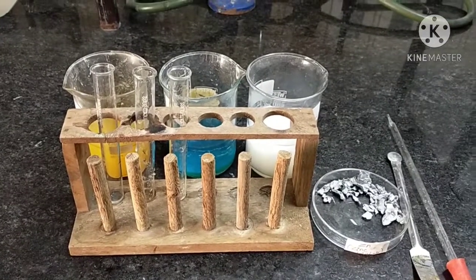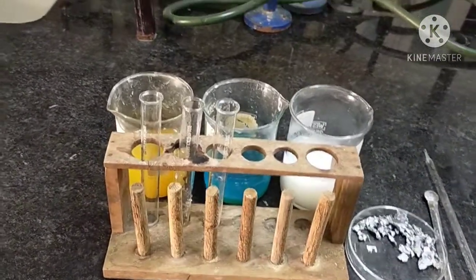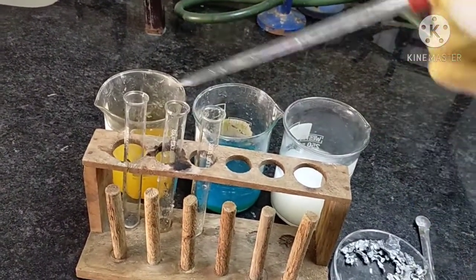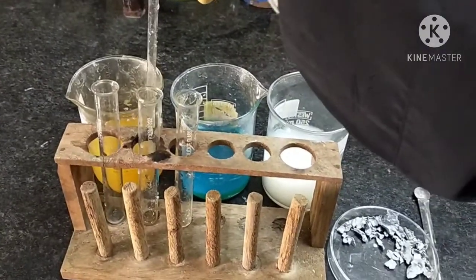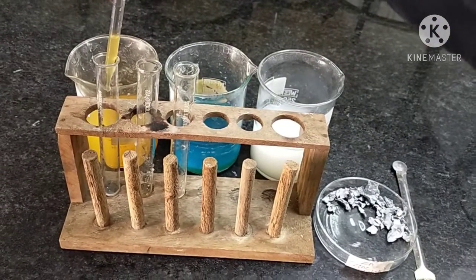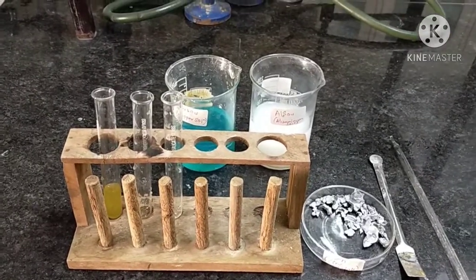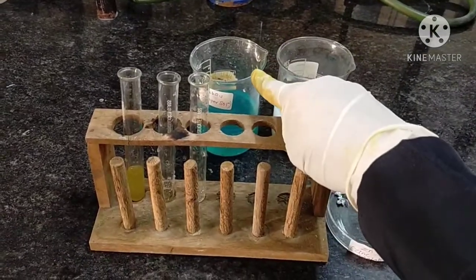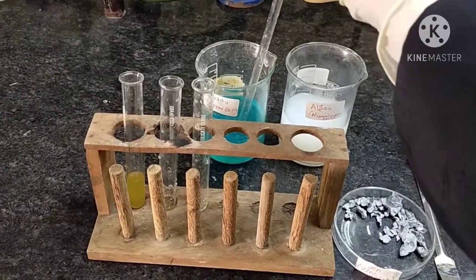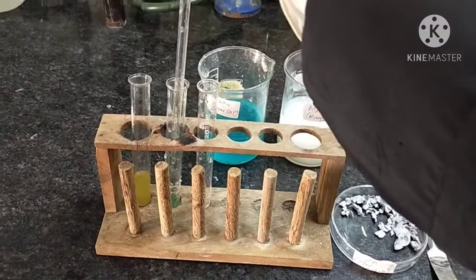So here we are going to take three other different solutions in three different test tubes. First, we will add ferrous sulfate solution in the first test tube with the help of a dropper. Take a dropper, take the solution, and pour it into the first test tube. After adding ferrous sulfate solution, now we will add copper sulfate solution in the second test tube.